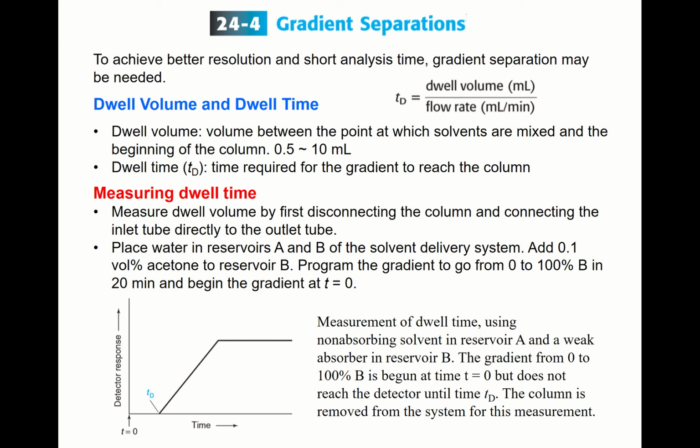That's the gradient separation. By that way, if you rightly choose the right solvent and the gradient, then a separation with better resolution and short analysis time is possible.